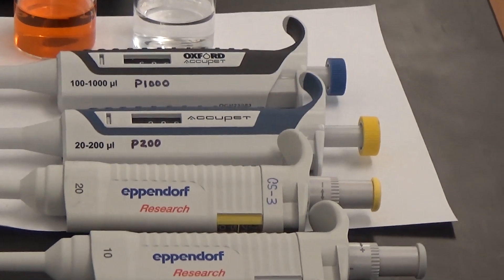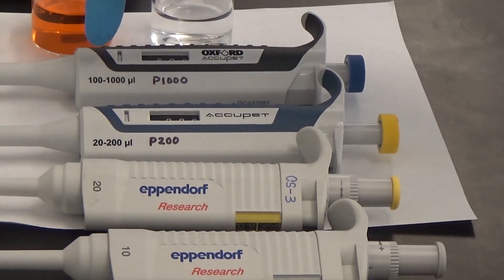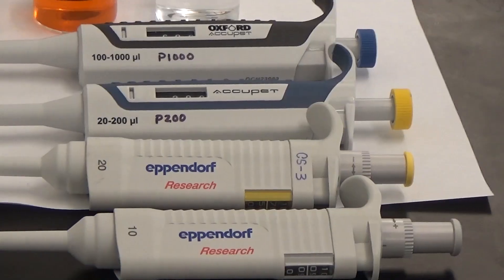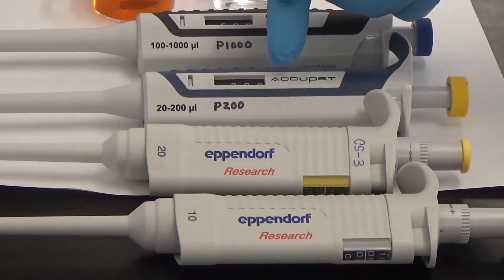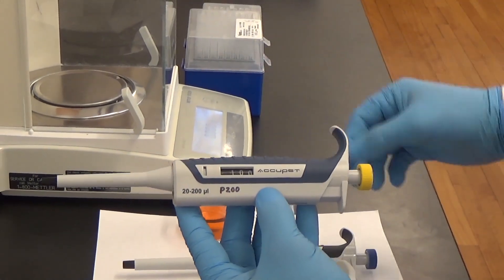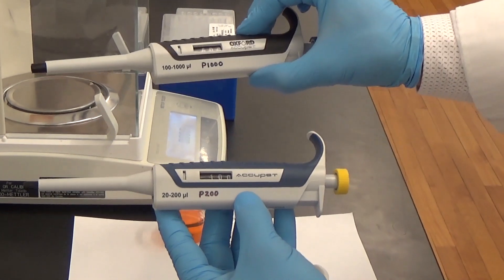Never exceed the upper or lower limits of these pipetters. To achieve the greatest accuracy, always choose the smallest size pipette. For example, if you want to transfer 100 microliters, then you should use a P100 or P200 instead of a P1000 microliters size.